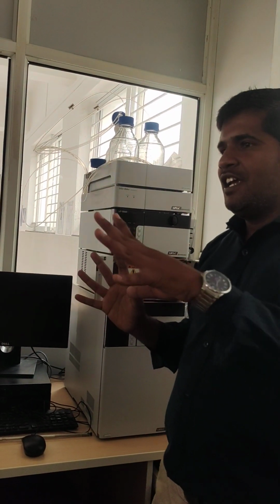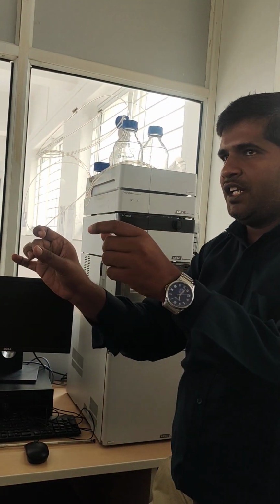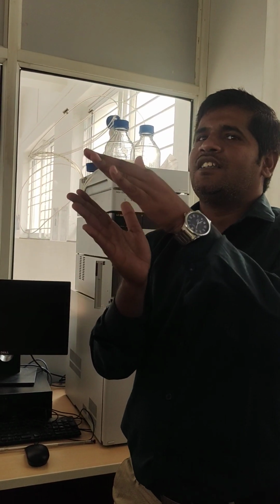So we have added 4 types of solvent. Initially, in the program, from 1 to 2 minutes we add one composition, and from 2 to 5 minutes 30-20 has been added. Then from 5 to 10 minutes the system has been changed to 40-10, and after 10 to 15 minutes it changes again to 35-15.